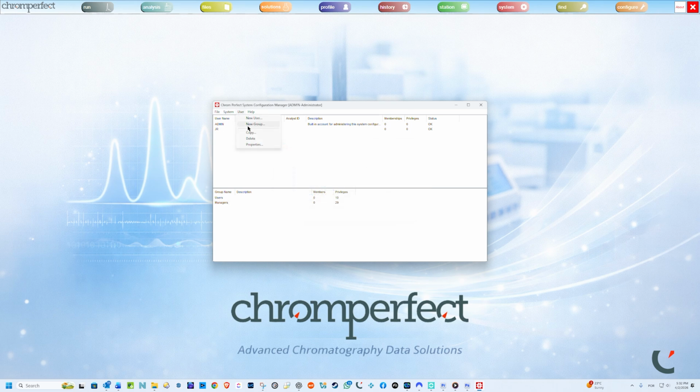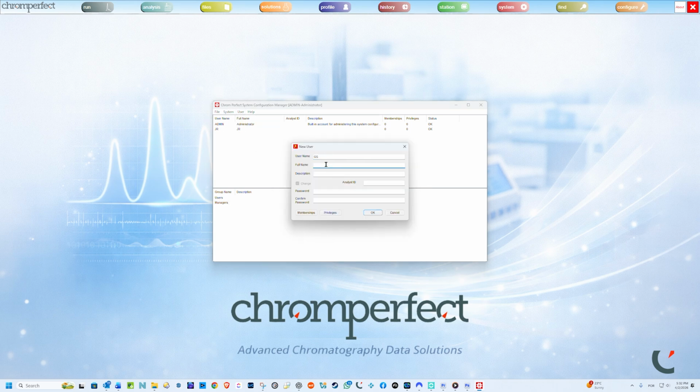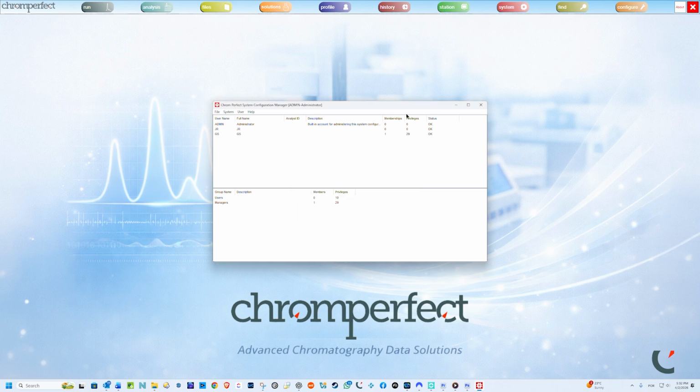Each group defines what actions are allowed within different areas of the system, such as configuration, data acquisition, data processing, and reporting. Users inherit permissions based on the groups they belong to, and can be members of multiple groups if required. This provides a flexible and scalable way to manage access across different roles within a laboratory or organization.